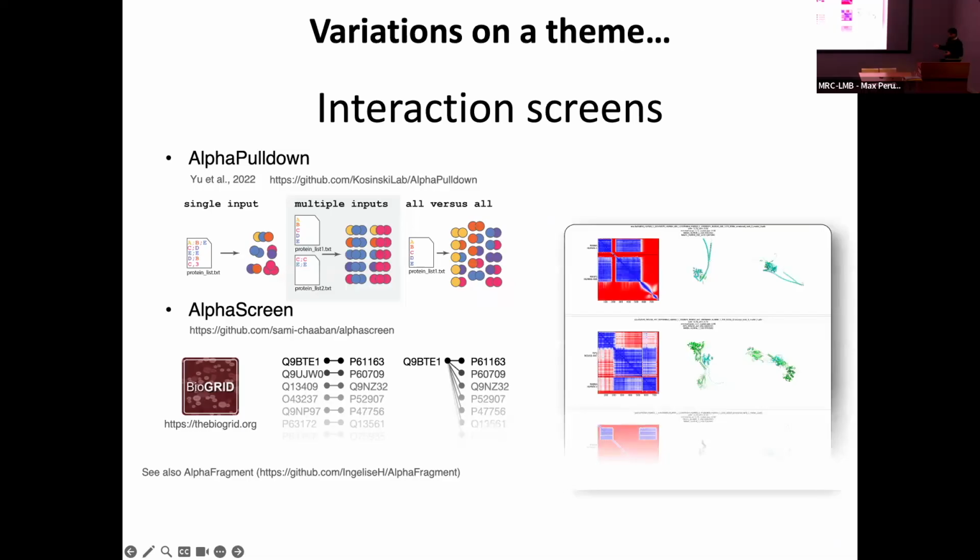However, the results are not easy to interpret, because you can imagine when you're going to have thousands or hundreds of thousands of these, to decide which one is real and which one is not can be tricky. There are some ranking numbers, like the ipTM. I won't go through this. Some we will explain to you in February, but it's still tricky.